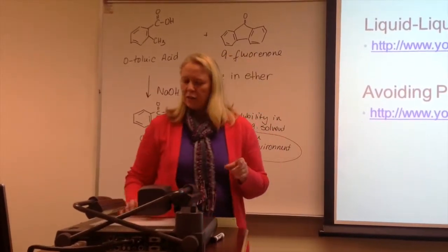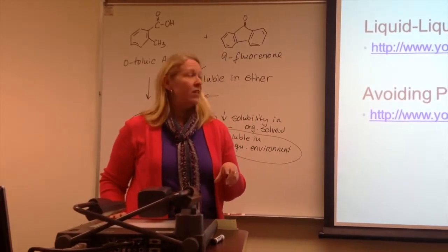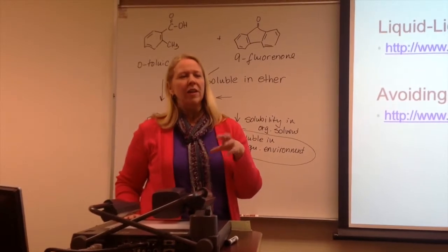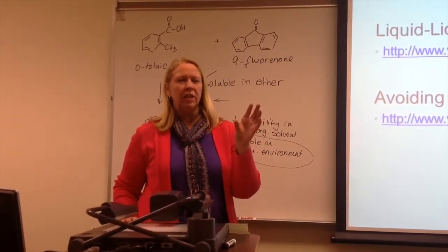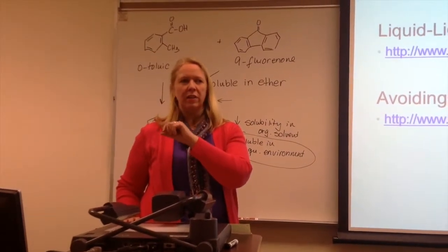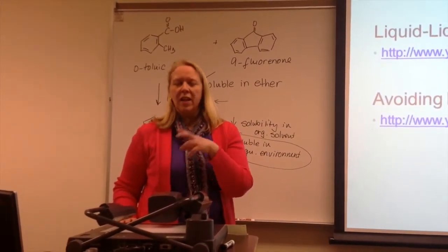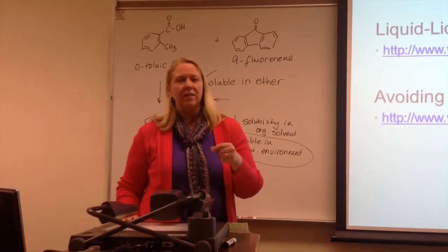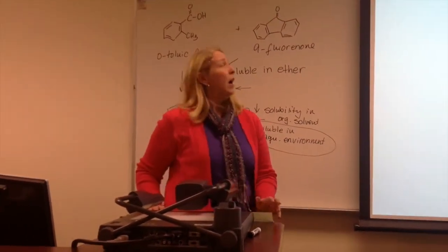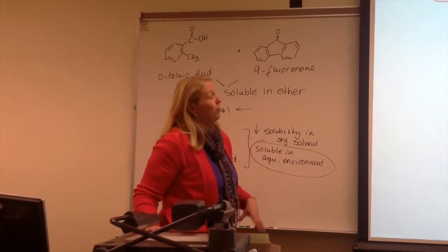So your book on page 116 and 117 has a nice calculation. You can actually go through the math. And it's all based on the solubility of the compound in your organic layer versus the solubility of your compound in the aqueous layer. And you get a constant basically. It's called the partition coefficient. But I want to show the results of that calculation.